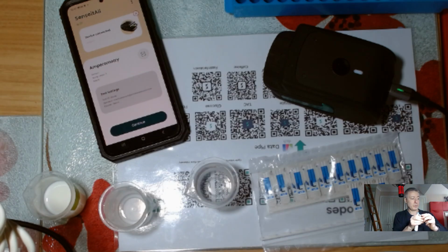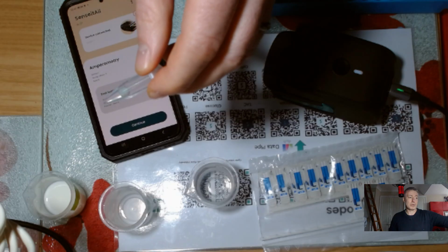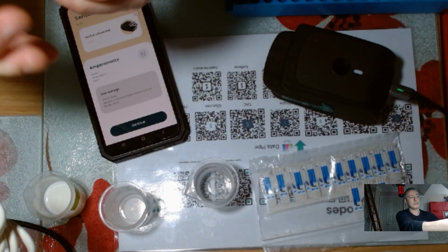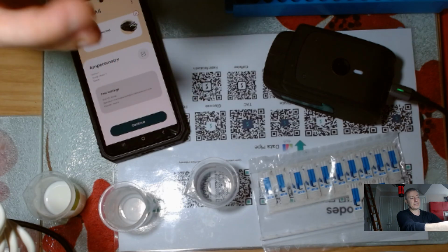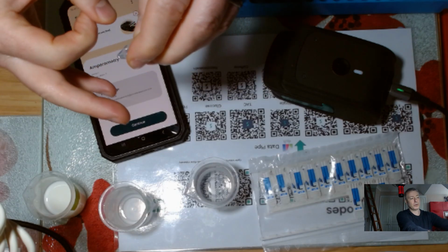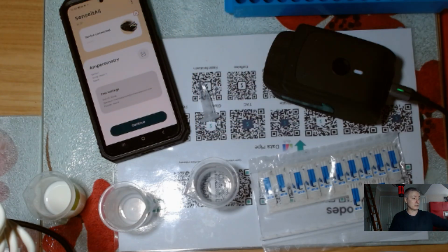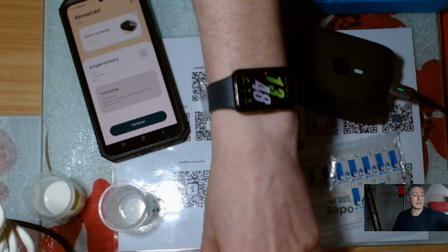I've approximately got them in the right ratio in terms of molecular ratios, that is. When people are using this, because PAA is not necessarily super stable, I think in part its sterilization and disinfectant properties possibly come from the fact that it is quite reactive. It's quite a strong oxidizer. So I've mixed those two materials together.